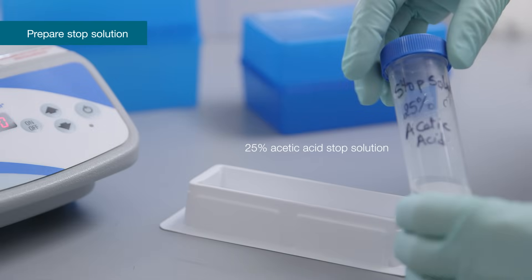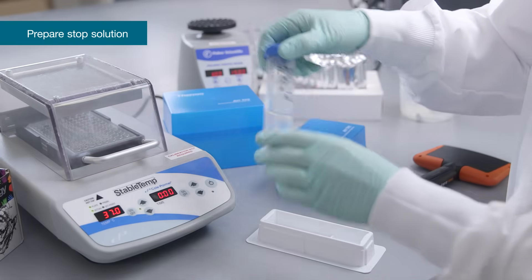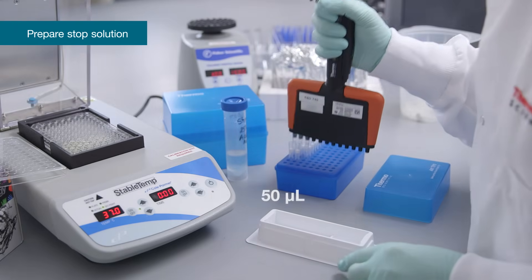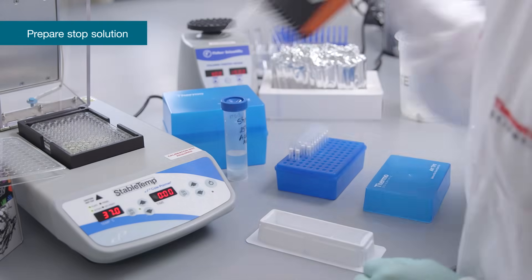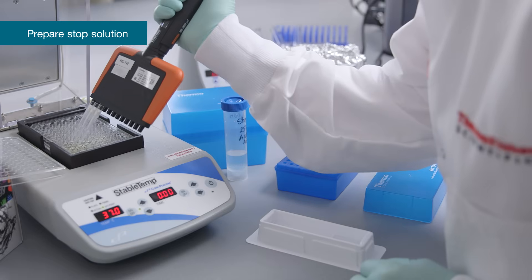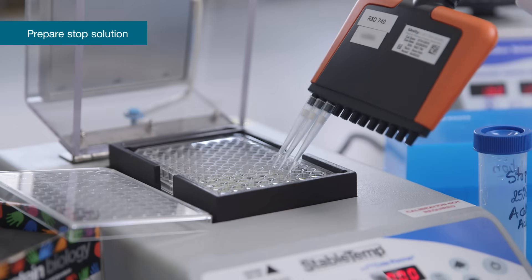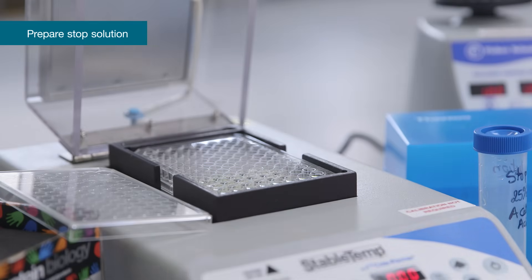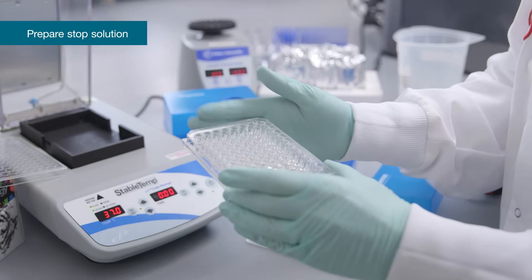During the incubation time T2, prepare a 25% acetic acid stop solution. Add 50 microliters 25% acetic acid per well to stop the reaction. Remove the plate from the heater and gently tap 10 times on the side of the plate to mix.